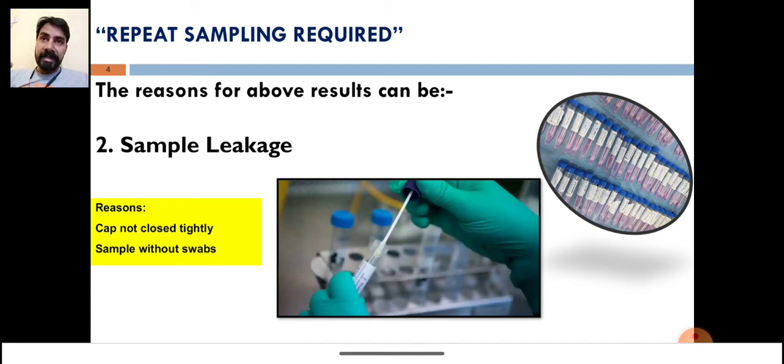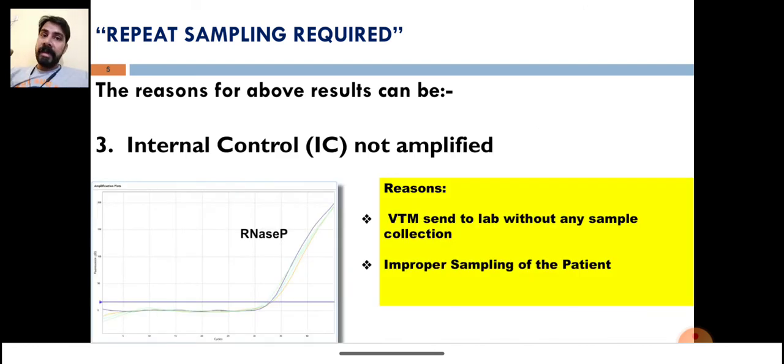The next reason is internal control not amplified. This is not a reason related to the collection facility. For example, your sample is collected, but in RT-PCR we didn't get any internal control amplification.